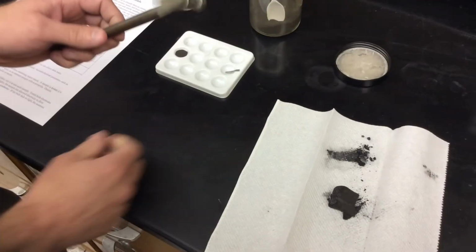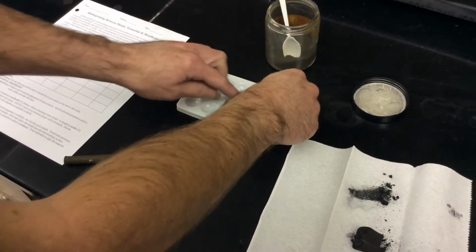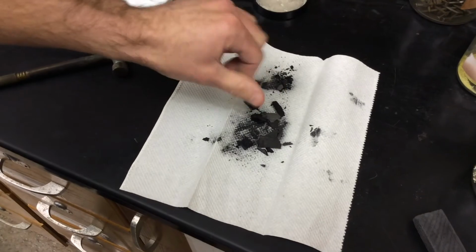So this is the one where your teacher might end up doing this as a demo. If I take this piece and hit it with a hammer, for example, all I'm going to do is flatten it out or change the shape of it. Another example is what I have over here. If I take this and hit it with a hammer, that's what would be considered brittle, where you break it into a lot of little pieces.